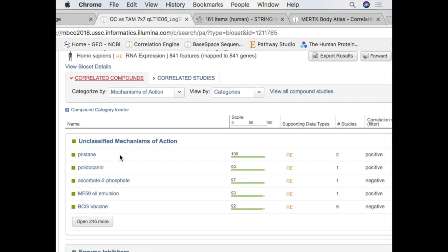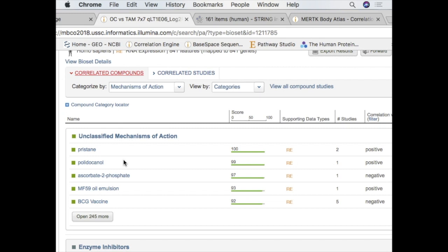This is kind of how I analyze. And like I said, it's not a process. It's more kind of viewing the data, different sections of it. Is there a theme that kind of develops? And I'm getting this innate immunity. And if you actually went down, there's also this whole angiogenesis thing going on.